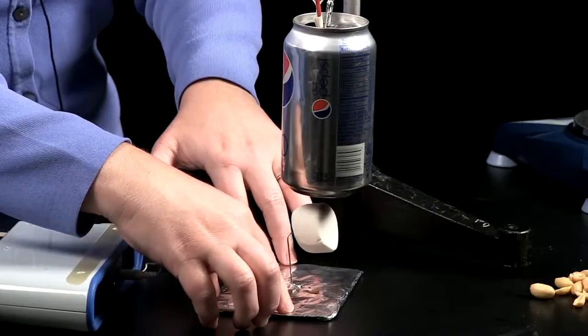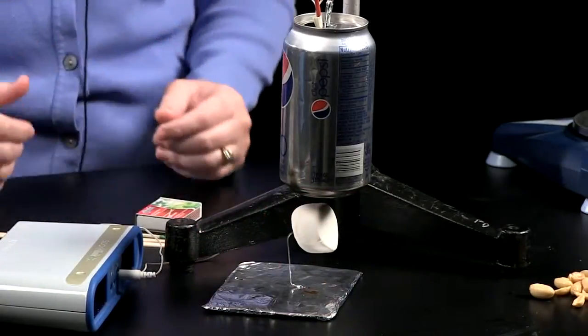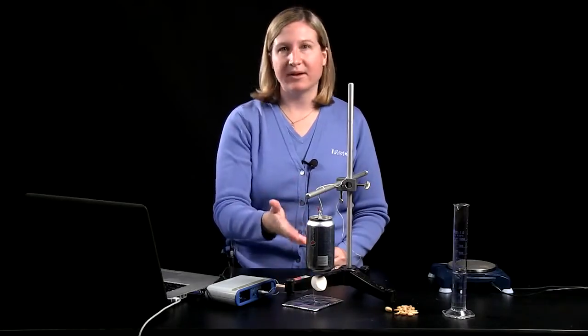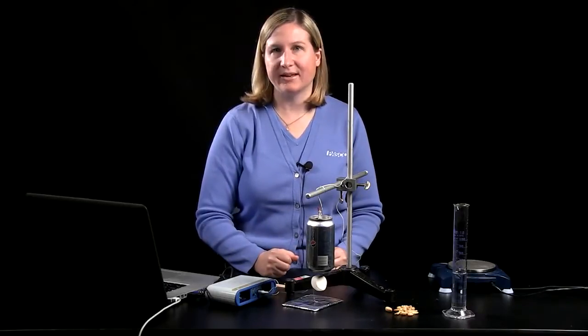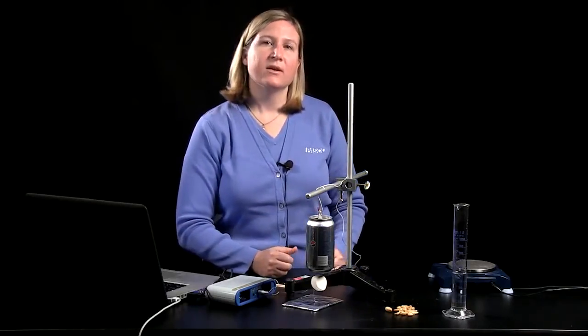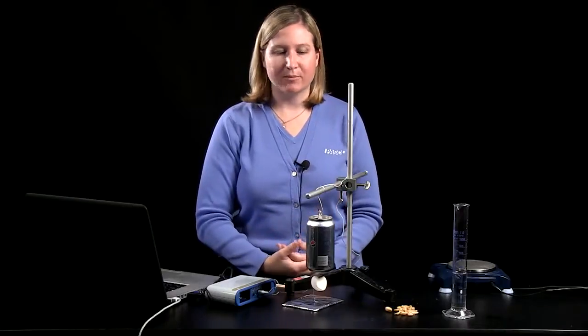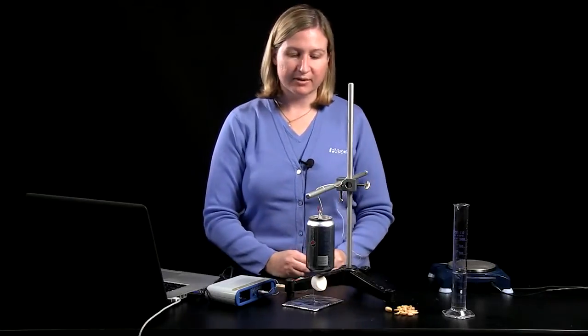I'm going to place the food holder with the food item directly below the can. We want to maximize the amount of energy that the water in the can gains from the food. There's going to be some energy transfer to the environment, but we want to minimize that as much as possible.